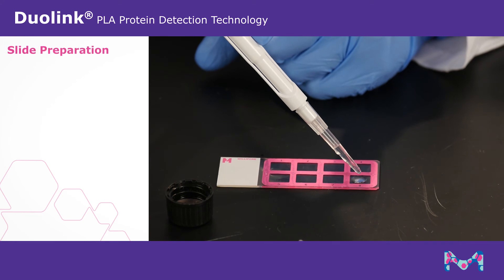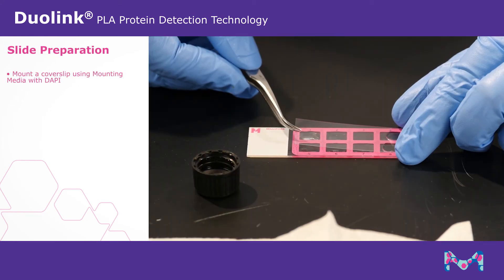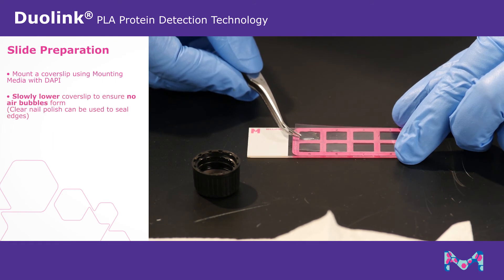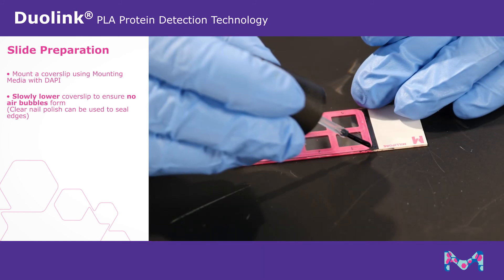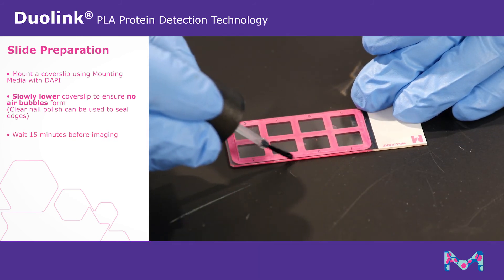To prepare your slide for imaging, mount a cover slip onto your slide using Duolink PLA mounting media with DAPI. Slowly lower the cover slip onto the slide to ensure no air bubbles form. Clear nail polish can be used to seal the edges. Wait approximately 15 minutes before imaging.